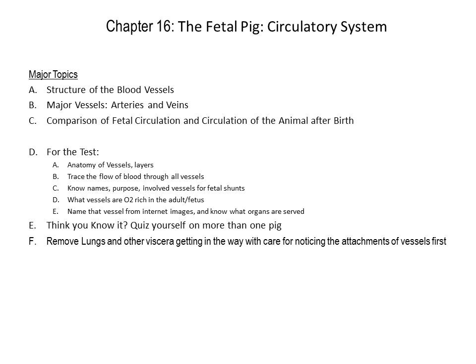So these are our stated goals. We'll take a look at the anatomy of blood vessels. We'll make sure that you know the difference in the arrangement of veins versus arteries. We'll go about starting the process of memorizing all the different arteries and veins in the fetal pig, being able to identify those. That's what you'll be probing around today.